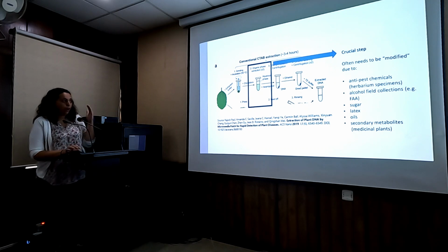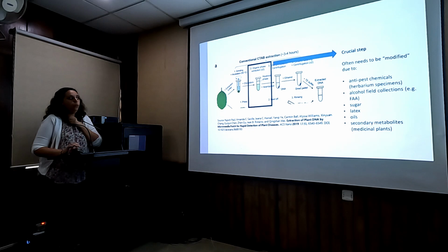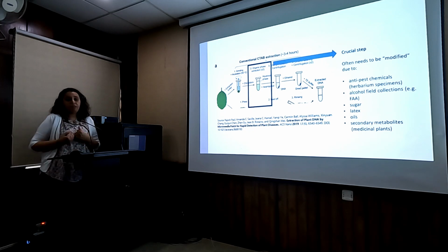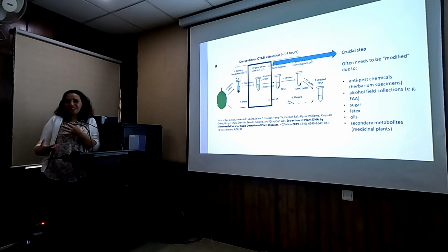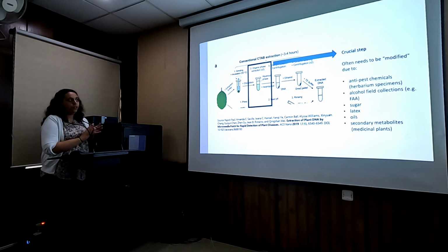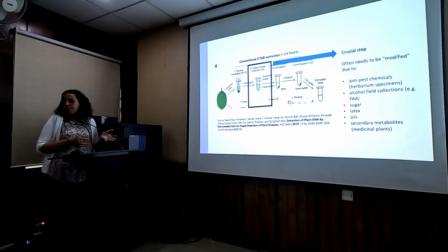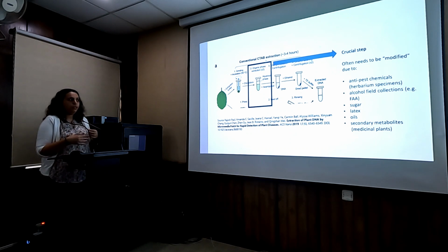So I found a figure that summarizes it well. And one of the crucial steps, and again, this is from my experience as a taxonomist, someone with more molecular biology background might discuss the other steps and how important they are, but this step of the organic phase extraction, and whatever you use in it, is very important because it's family dependent or group dependent. So for each plant family, you might find you need to tweak it a little bit to make it work better.